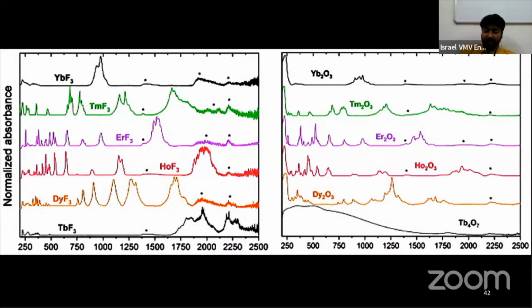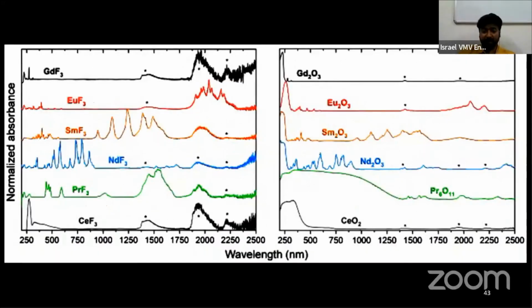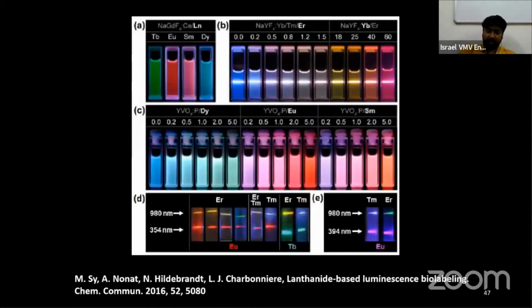And when an organic molecule joins these lanthanide elements, you find one more band, a charge transfer band also. See, so many colors. Because the F orbitals are many in number and tunable with attachment of ligands or using a certain wavelength, you observe different colors.